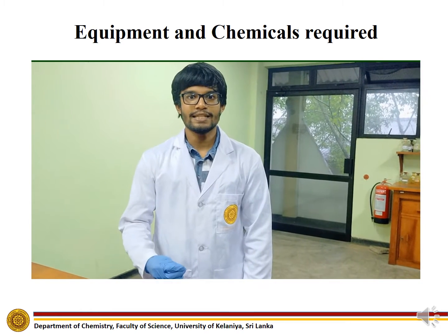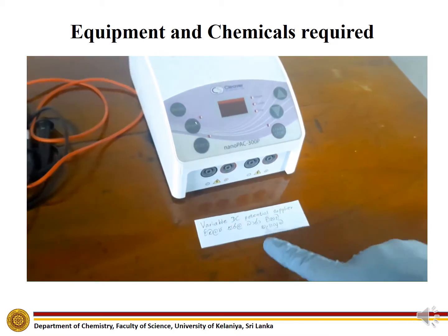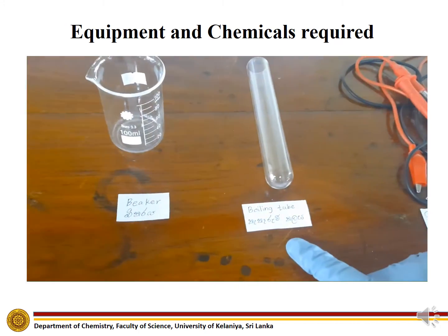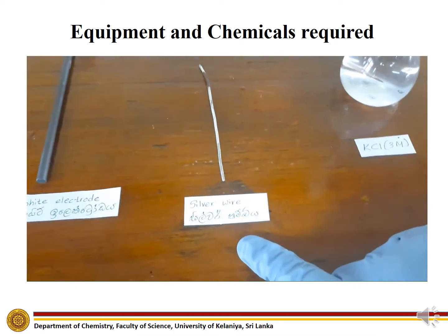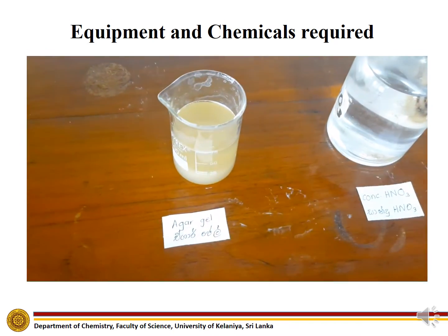These are the chemicals and equipment needed for the experiment: variable DC potential supplier, circuit wire, boiling tube, beaker, glass tube, potassium chloride, silver wire, graphite electrode, concentrated nitric acid, and agar gel.